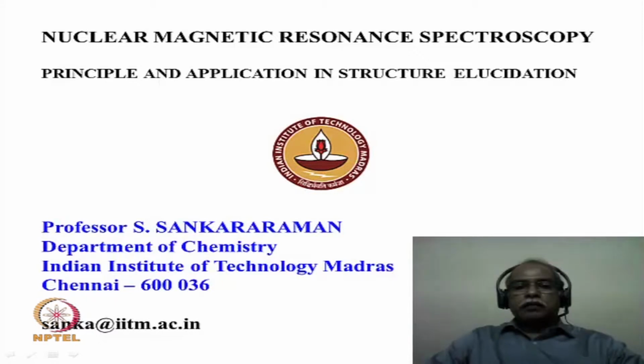Hello, welcome to Module 4 of the course on application of spectroscopic methods in molecular structure determination. In this module, we will continue with NMR spectroscopy and we will actually see some NMR spectra of very simple organic compounds. We will try to interpret the spectrum of these compounds and see whether we can familiarize ourselves with the chemical shift and the coupling constant values.